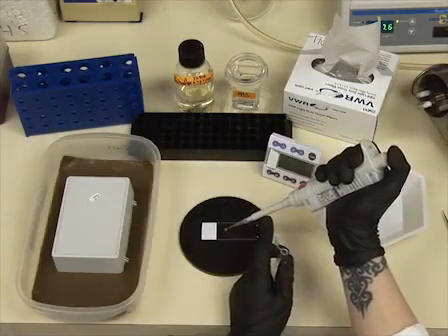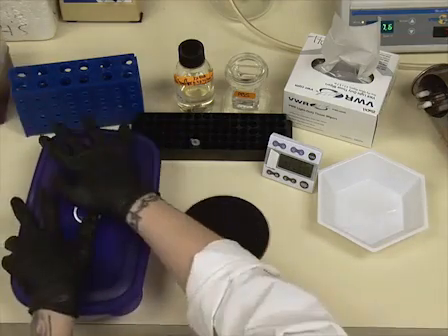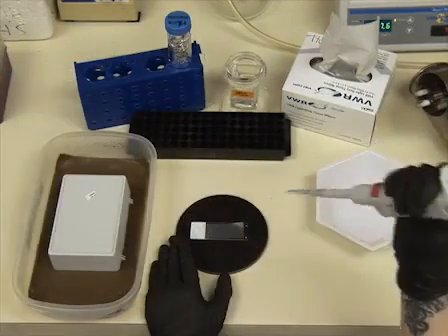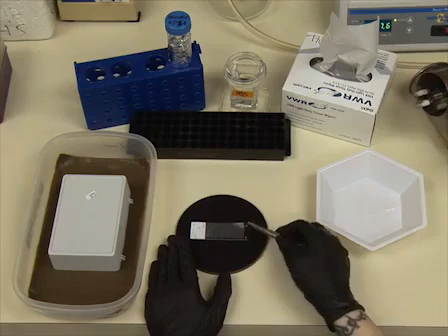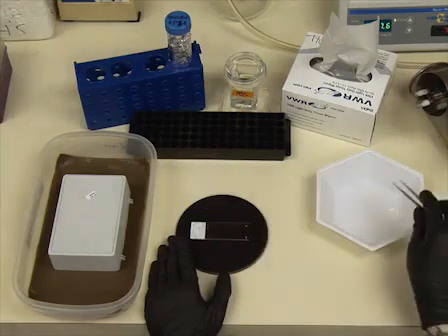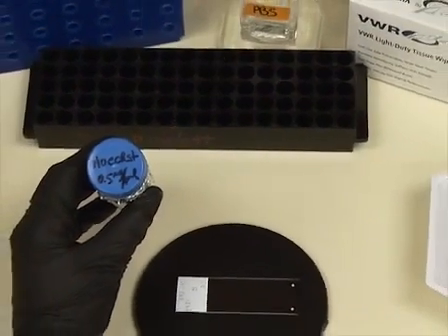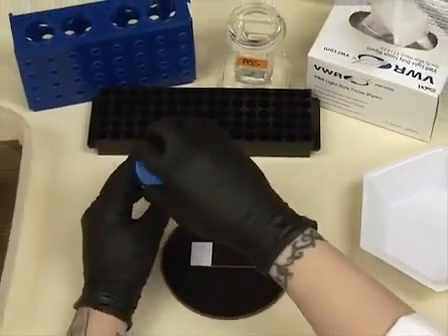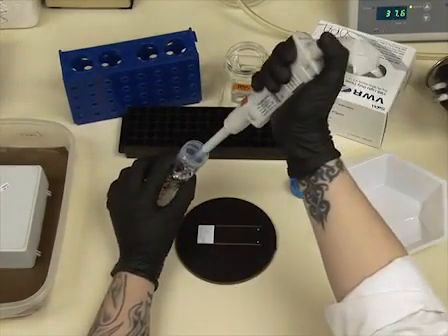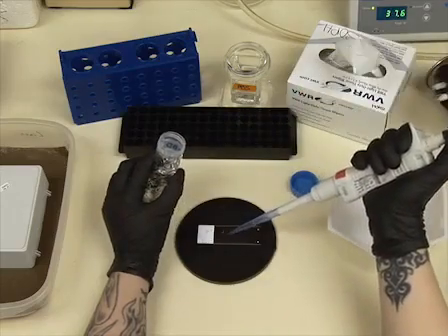Apply the secondary antibody to slides and incubate them at room temperature for 1 hour. As before, float the parafilm off the slide using PBS and remove it using forceps. Again, this is the first of 4 5-minute PBS washes. In the third wash, we include Hoechst 33258 as a nuclear counterstain, which is diluted to 0.5 micrograms per milliliter in PBS. There is one more 5-minute wash following the Hoechst wash.